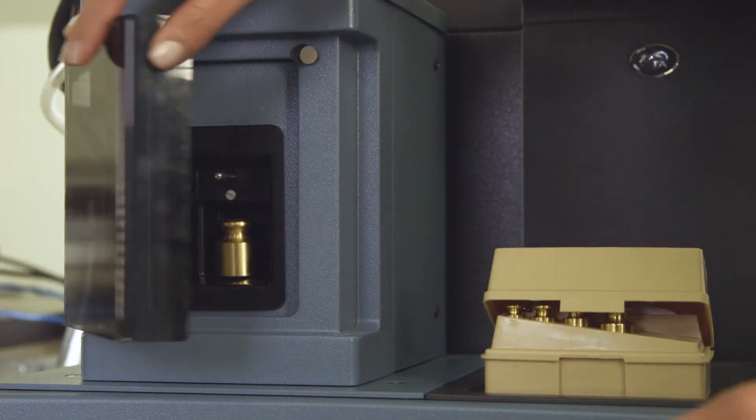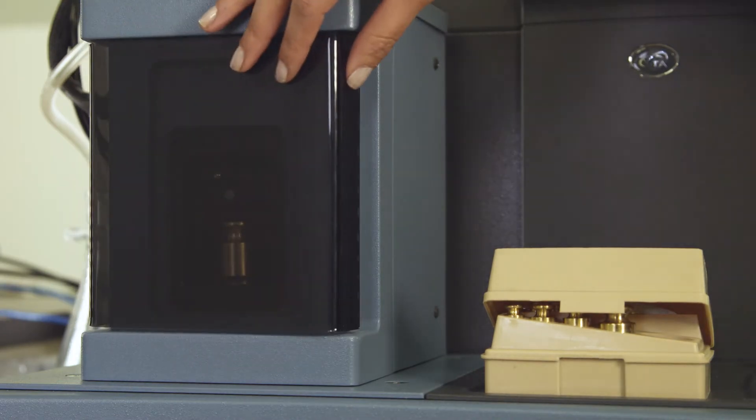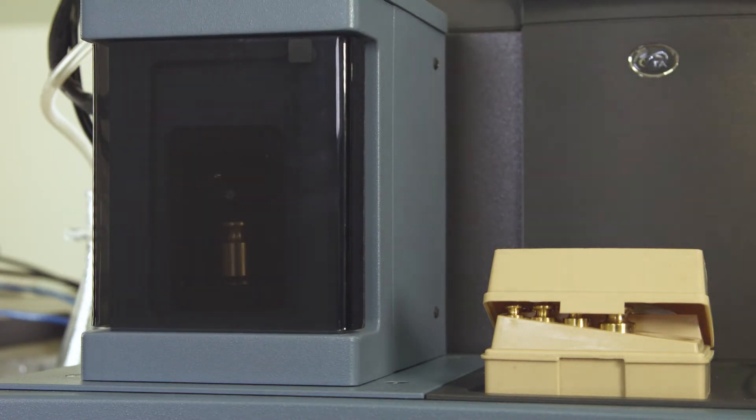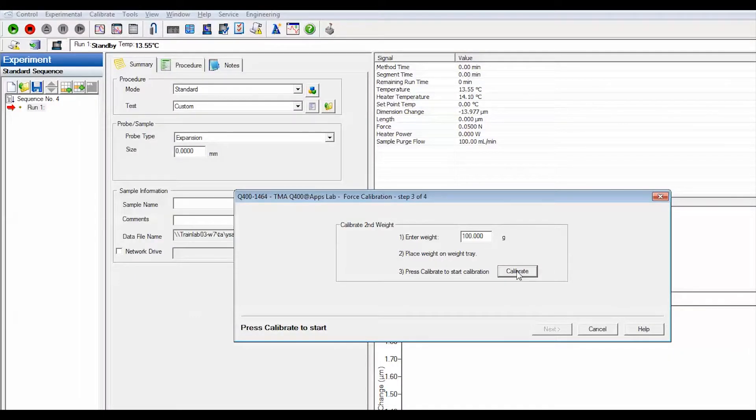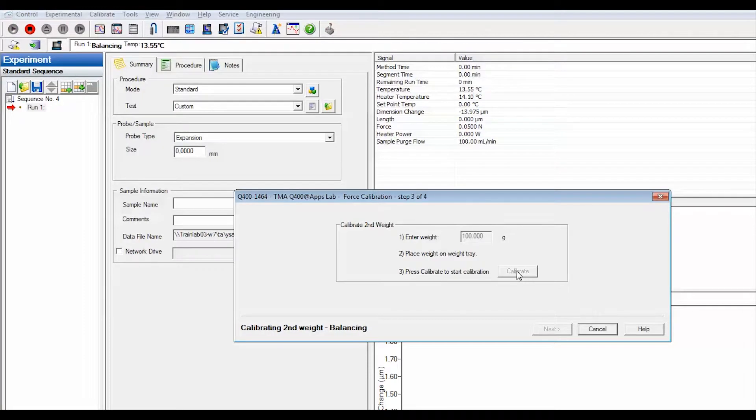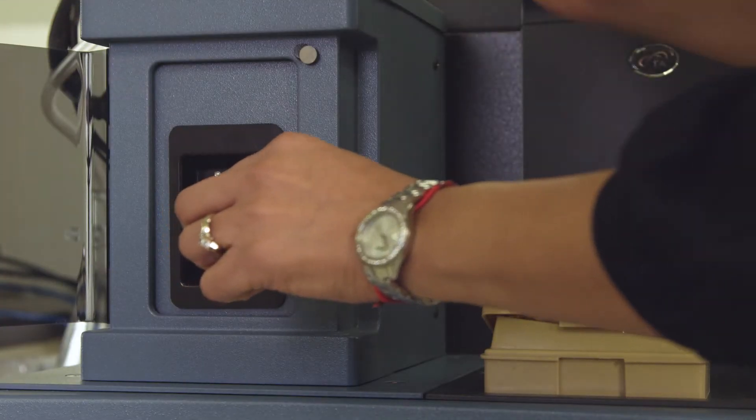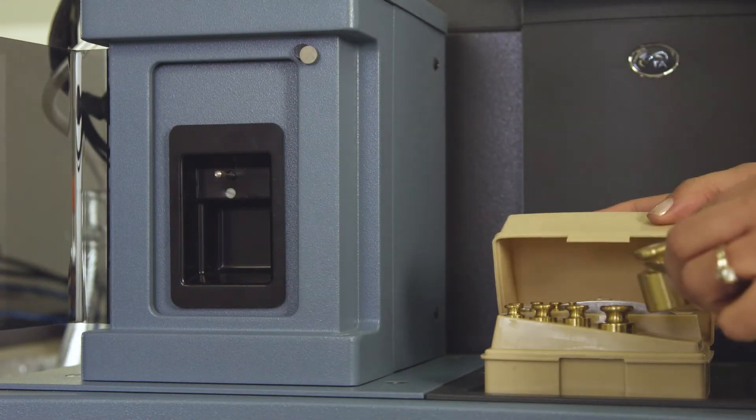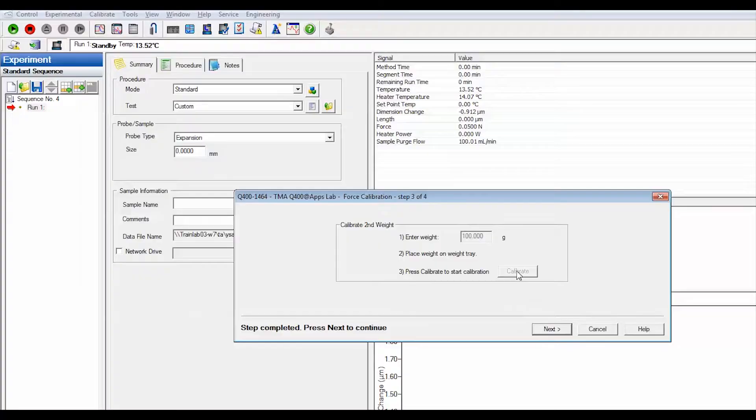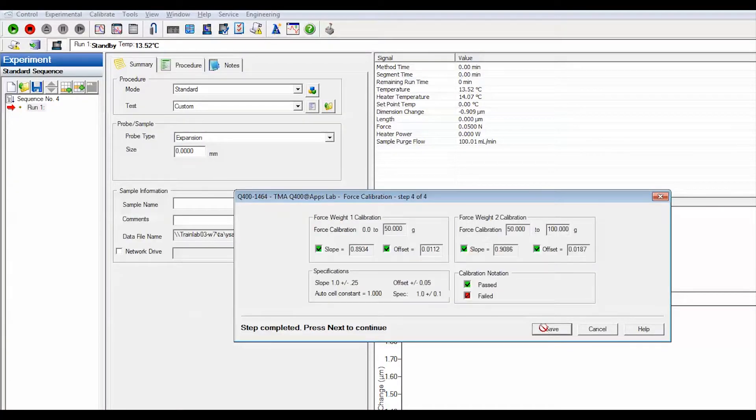Place a standard weight on the weight tray. Press calibrate. Wait for the calibration to be completed and remove the weight from the tray. Select next.